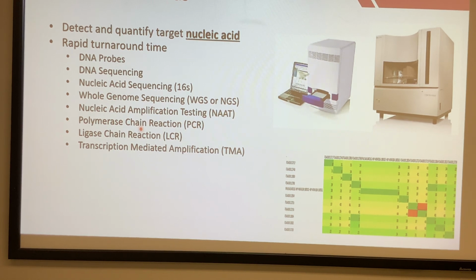Polymerase chain reaction is to amplify your target nucleic acid, so you can detect it later in a much higher volume. Now, what is nucleic acid? Depending on your target, you could have RNA, you could have DNA, right? But anyway, they are detecting the pathogen's genetic information, the nucleic acid. So the qPCR is quantitative PCR. It's actually going to give you the detection in real time, okay?